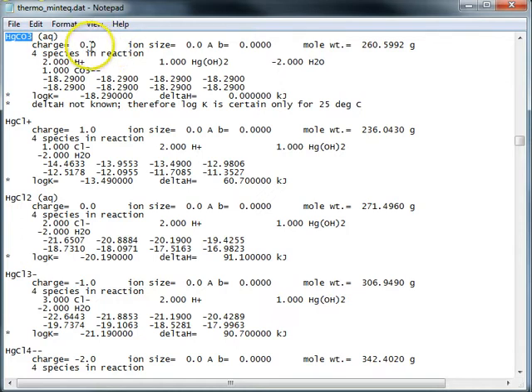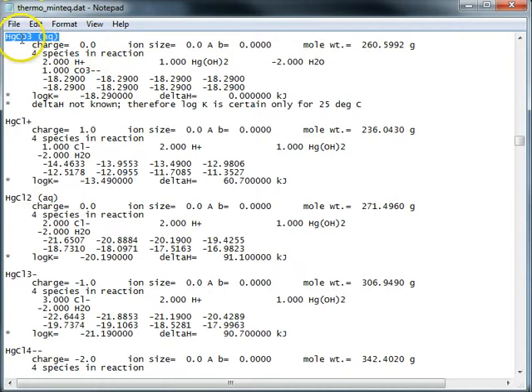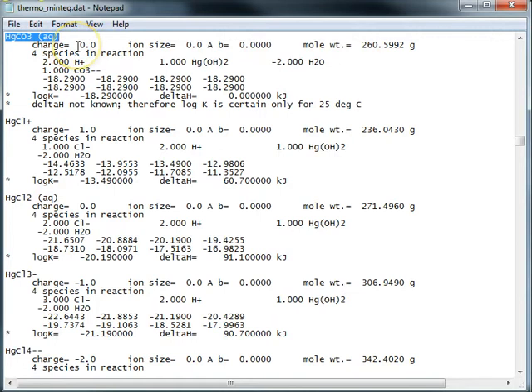So the first thing, this is a thermal dataset. The entry is HGCO3 aqueous. We have some basic properties for that particular molecule. It's charged, it's neutral.